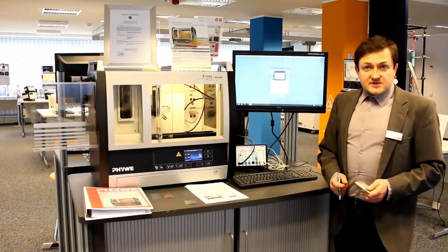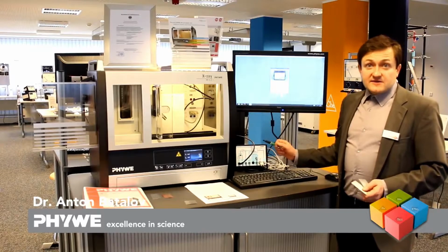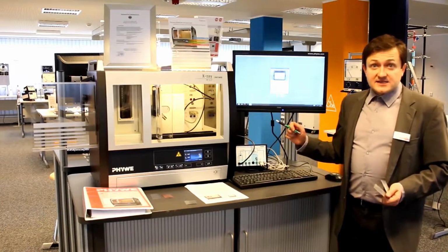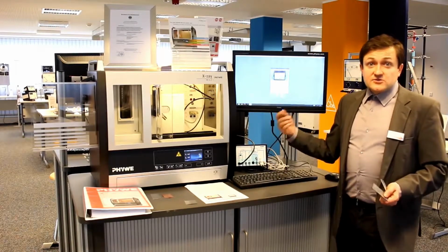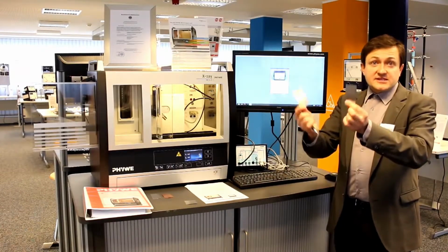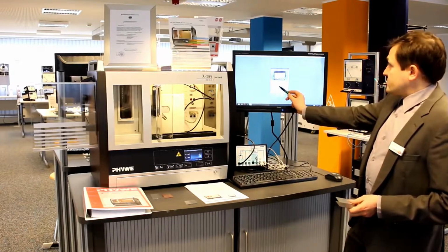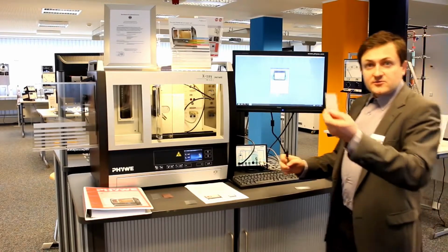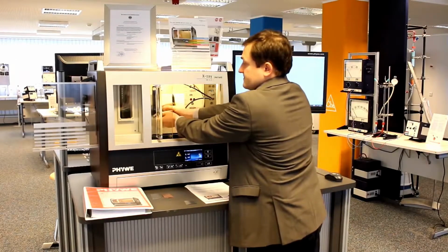As a first step of the experiment, we have to calibrate the multi-channel analyzer. So we have to assign X-ray energies to some known lines. You can use a direct beam of the X-ray to do this, or you can use some pure materials like iron and zinc. In this case, you go to calibration of the multi-channel analyzer and you put some pure material inside the X-ray beam.